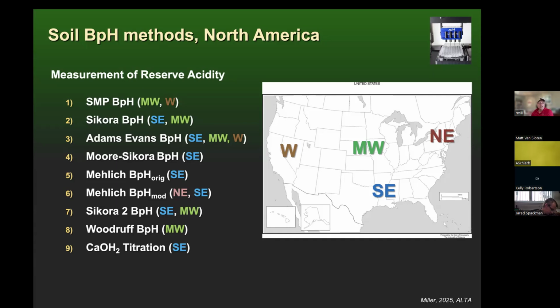The calcium hydroxide method is unique. It's only done at the University of Georgia. It's basically a one-shot measure of pH, come back, add calcium hydroxide, you get a second data point, and you can measure the amount of reserve acidity that has been eliminated.